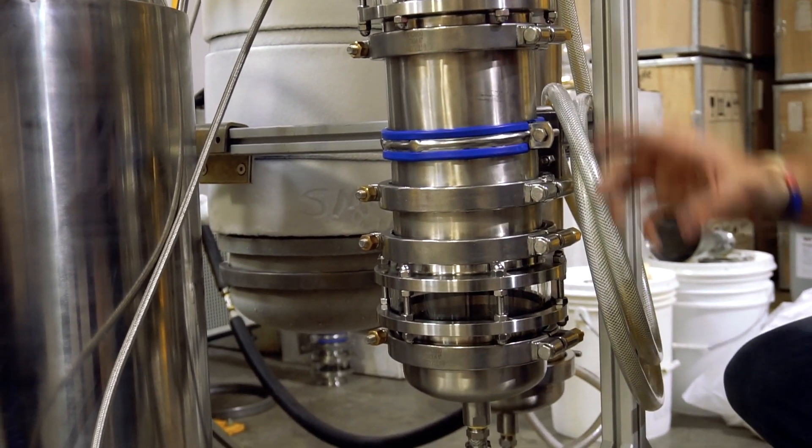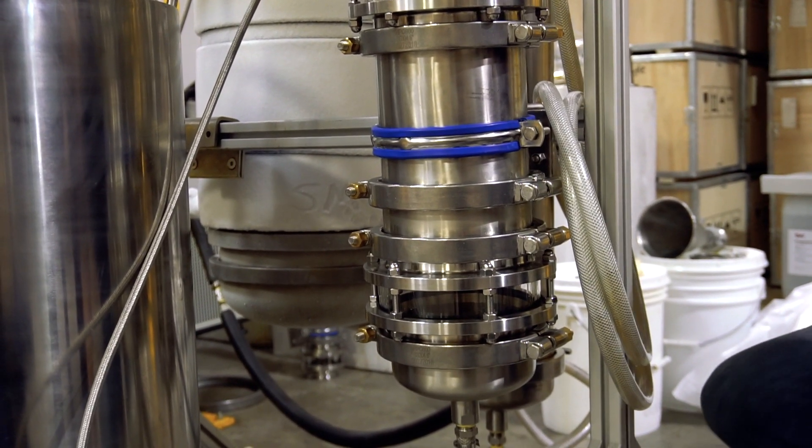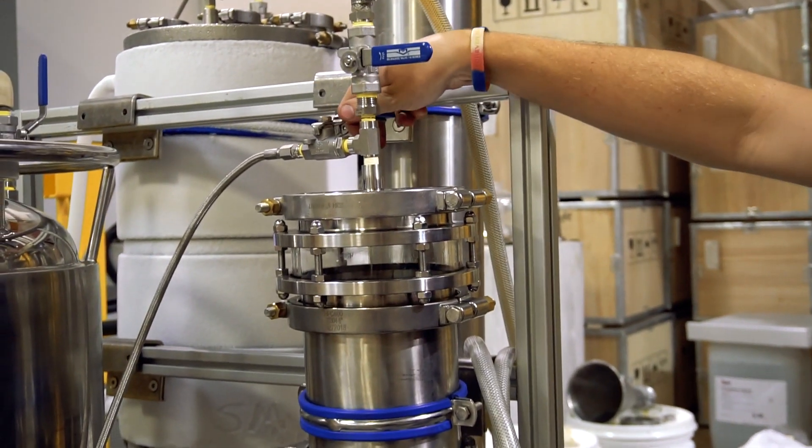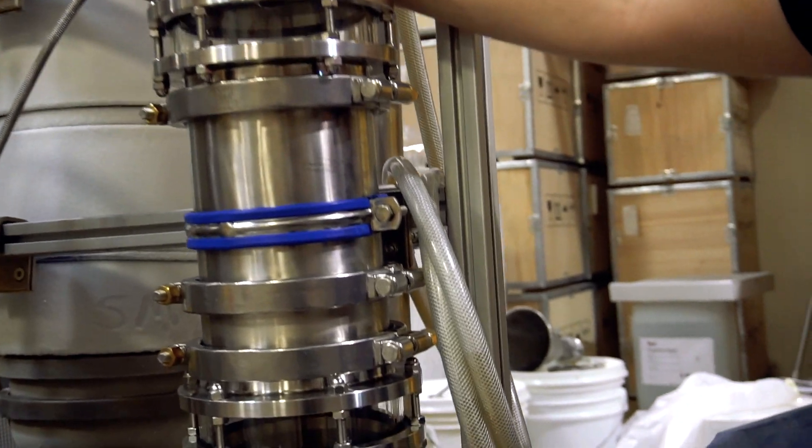Now that we have some liquid draining through our powder column, we're going to close the top and use a little bit of nitrogen assist. This is going to help us push the liquid through the column.